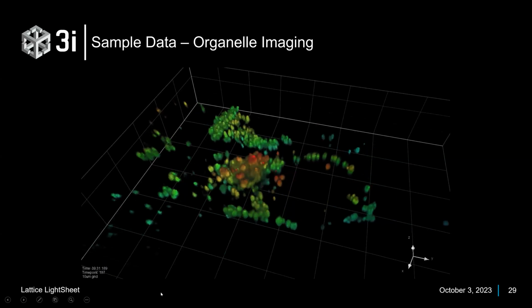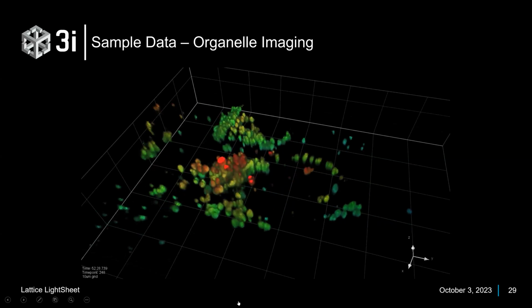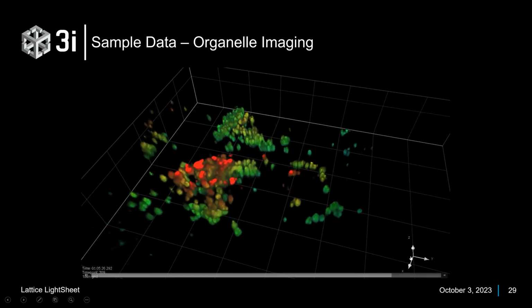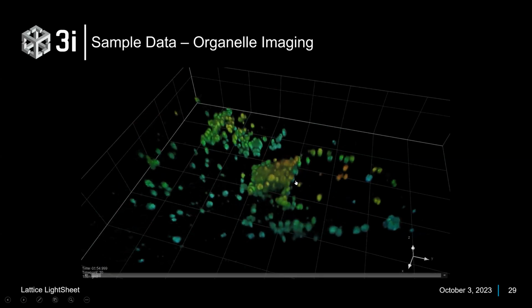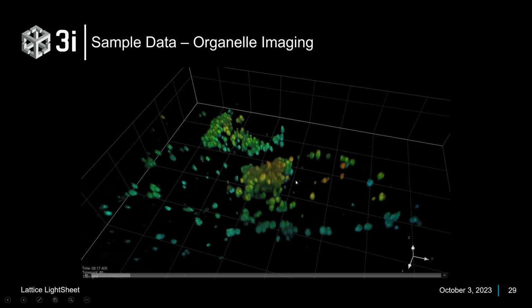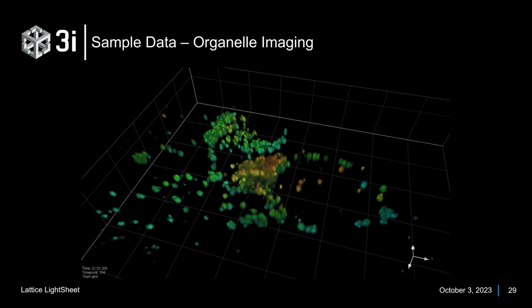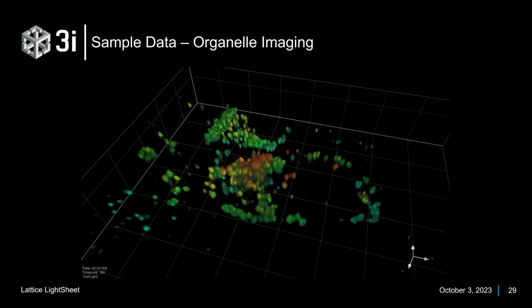You can see this continues to count up. This again highlights the gentle nature of the system, and I also didn't hide this in a maximum intensity projection. This is partially the Z resolution that you can see in this view, rendered out with a very nice axial resolution. You combine that with the color by depth, and you can see trafficking up and down as well as laterally across the sample.